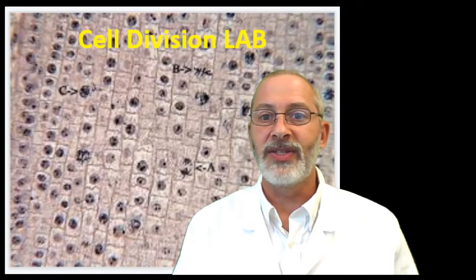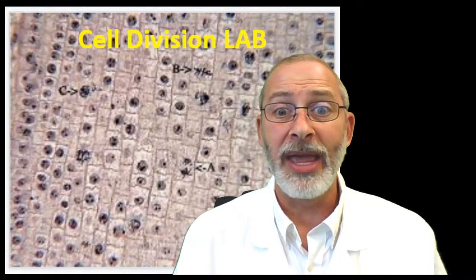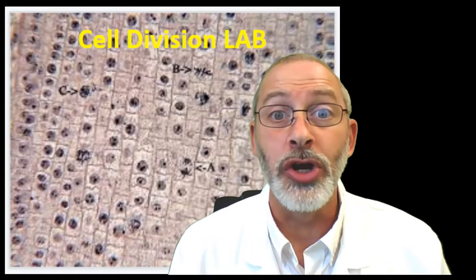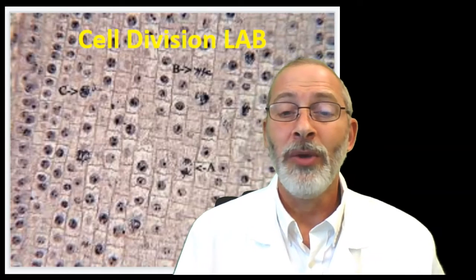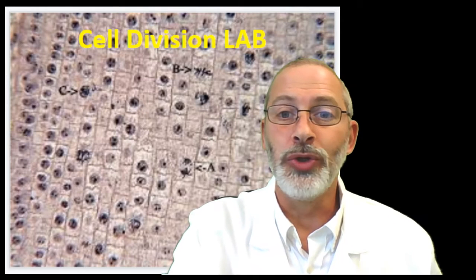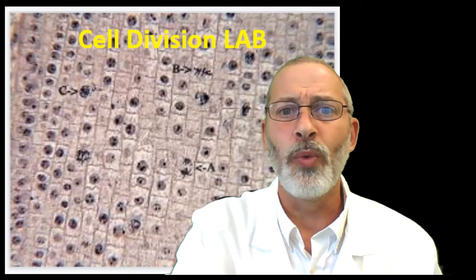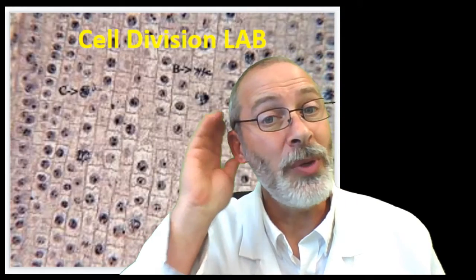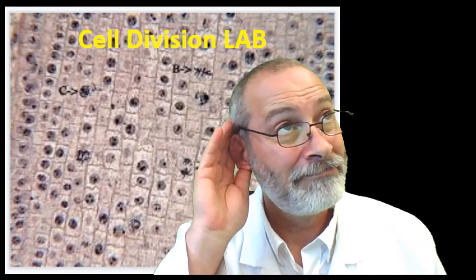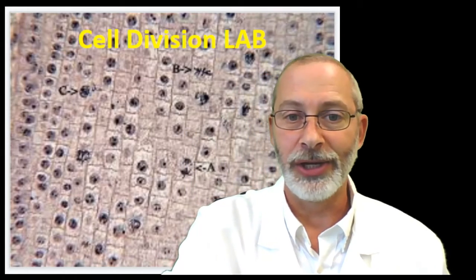All right, let's move on to today's lab activity, the cell division lab. And this picture here of an actual slide may overwhelm you at first. But what we're going to try to do, and I'll show you here in a moment, is to zoom in on some of these cells. And by the way, any idea what kind of cells these might be? What would make you say that? Plant cells. You can see the cell walls very, very clearly here.